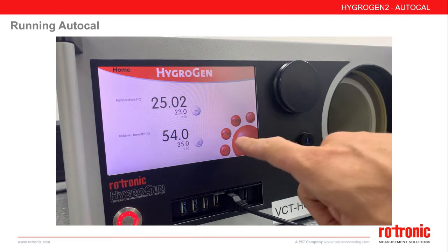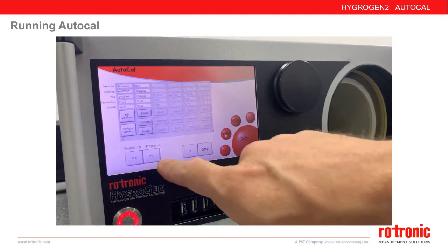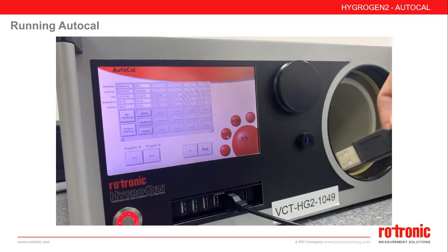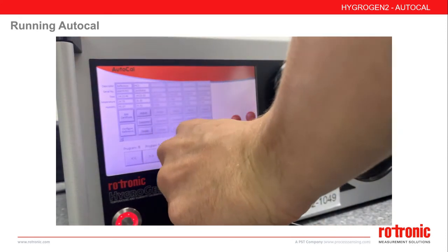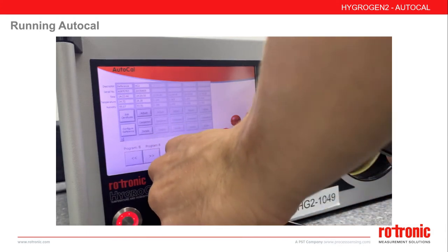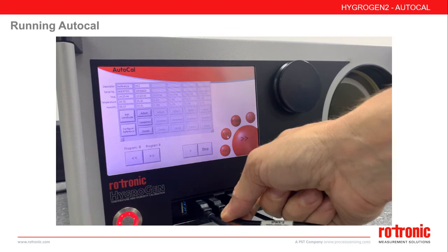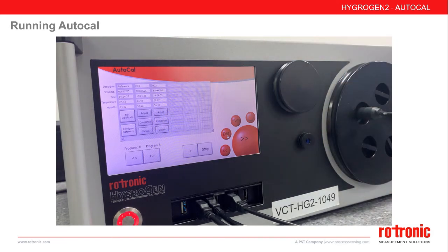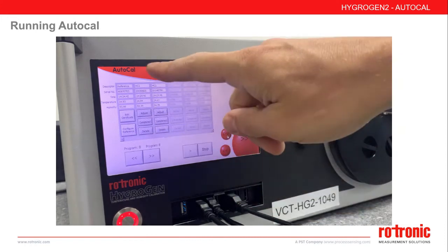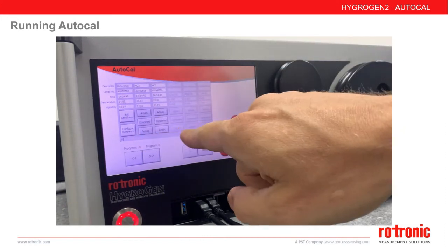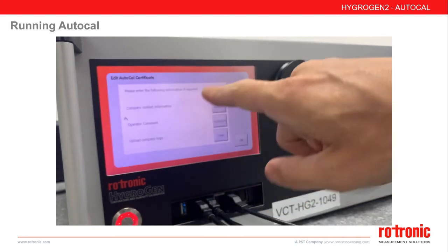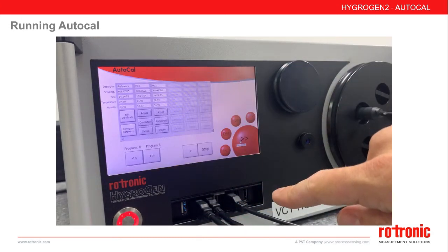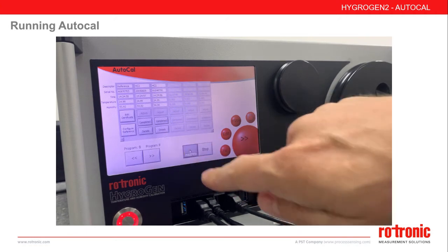To run an AutoCal program, select the AutoCal screen, choose the desired program, and review the points if necessary. You must then enter at least one compatible Rotronic probe via a suitable USB lead to the front USB ports, and insert the probes correctly into the Hygogen chamber itself. You will now see any connected probes on the main AutoCal screen, as well as the reference probe information. You have hotlinks through to the certificate information as well as the reference setup. When you are ready, you can start the program via the play button.